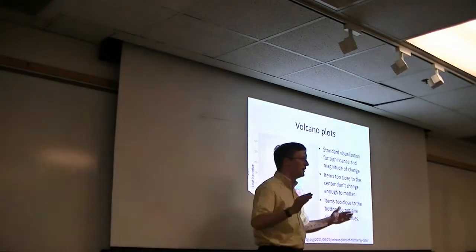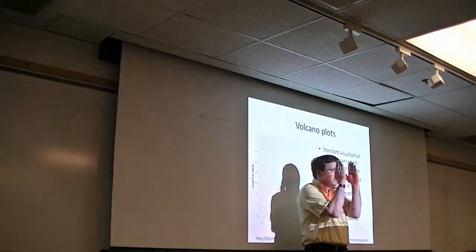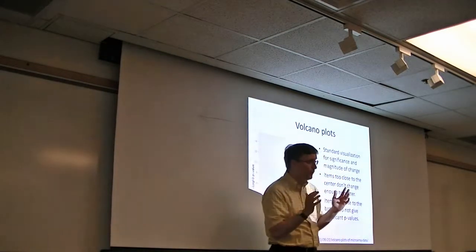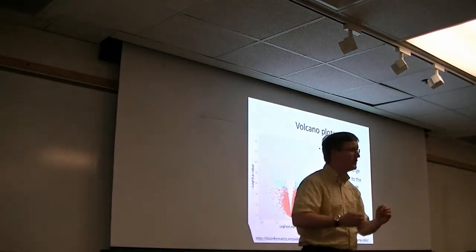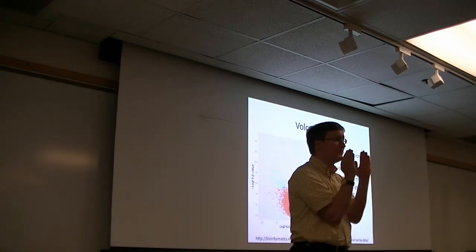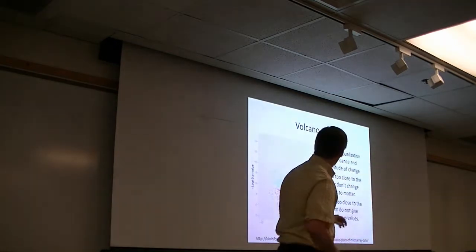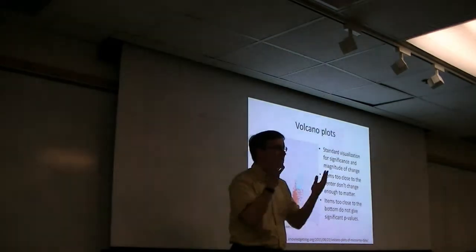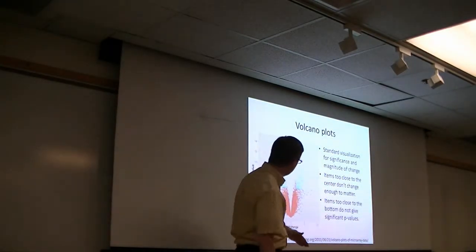So anything that's really close to the 0 line in the middle is going to be not a very big fold change. And generally speaking in biology, if we see a very small log fold change, even if it's significant, we tend to ignore it. So anything close to 0 on here is going to be called not a big enough change to care about.